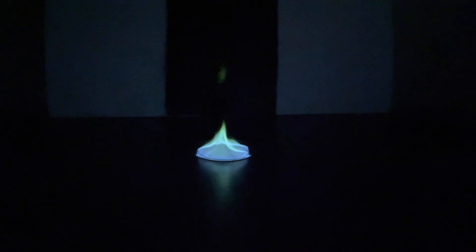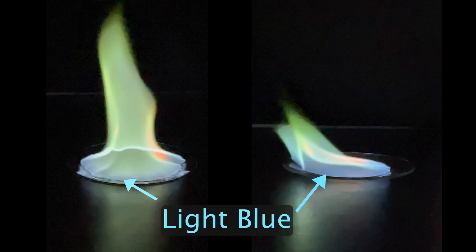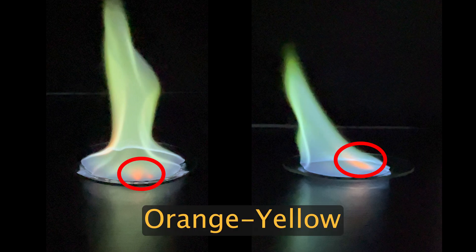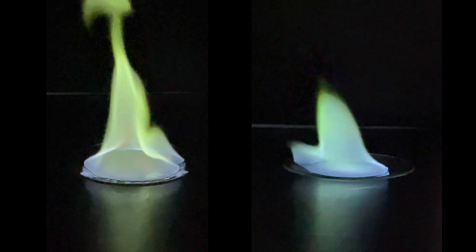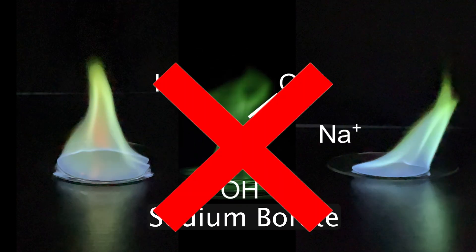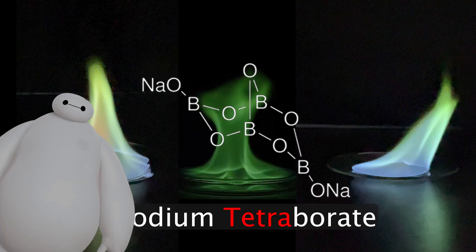It was so beautiful, in fact, that I had to give it another try. Both flames burned pretty much the same color — light blue at the base of the flame and green near the top. They also both had occasional flickers of an orange-yellow flame, which is probably due to the sodium ions in the sodium borate, since sodium is known to give off a yellow flame. My flames, however, were pretty different from Nile Red's perfectly green flame. This might be because the sodium borate I used wasn't actually sodium borate, but sodium tetraborate, also known as borax.